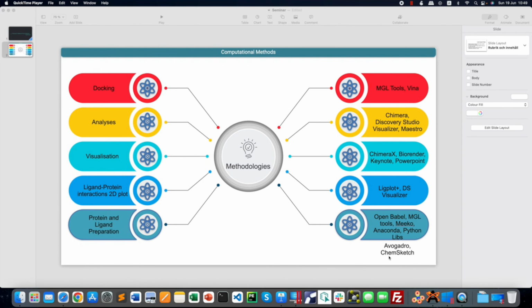As we referred from the paper, we took the target of the protease protein of COVID-19, and the target that we are going to see, we can download it from different types of databases, and we can process it in order to do the molecular docking analysis using Vina software.